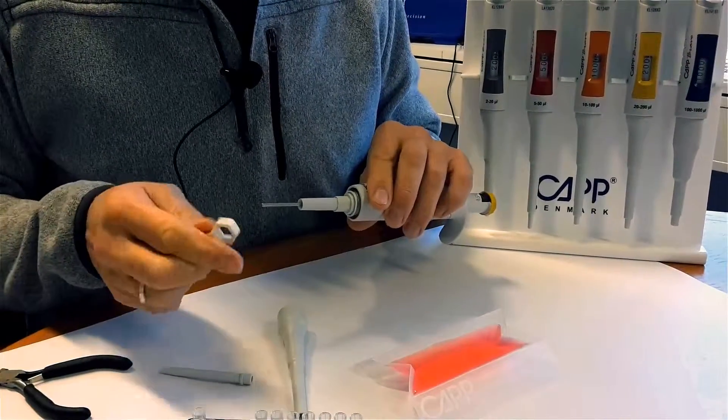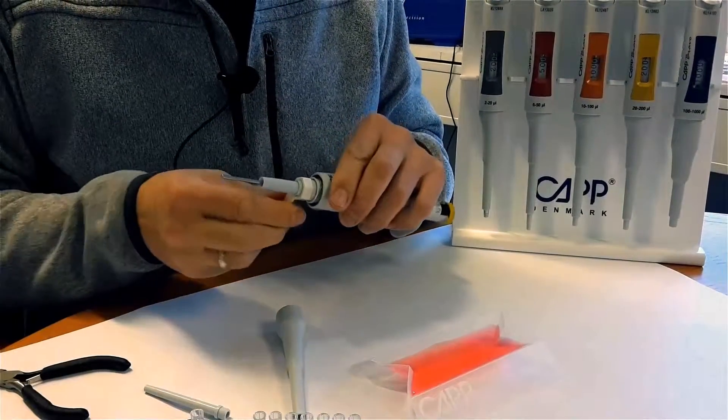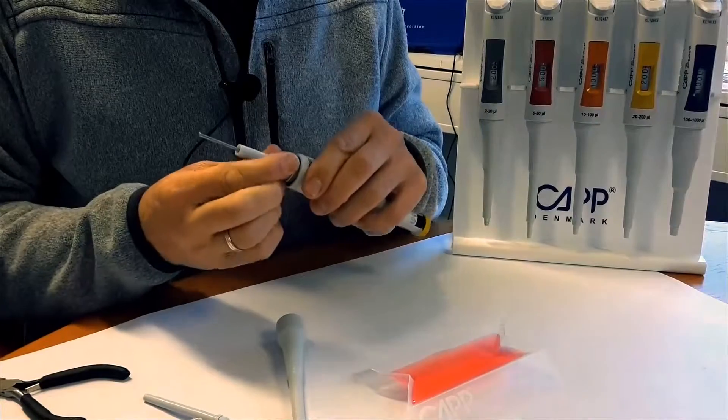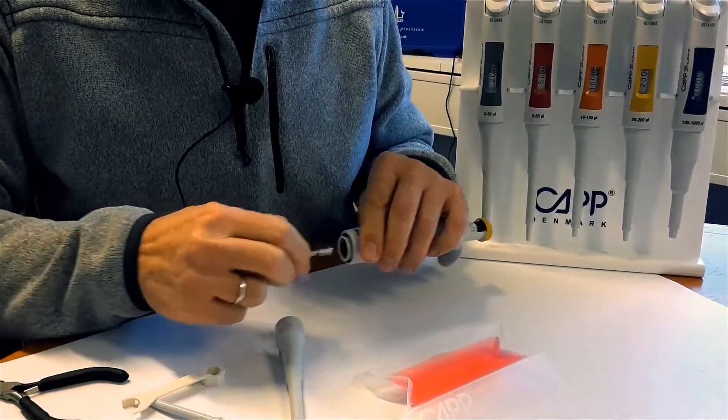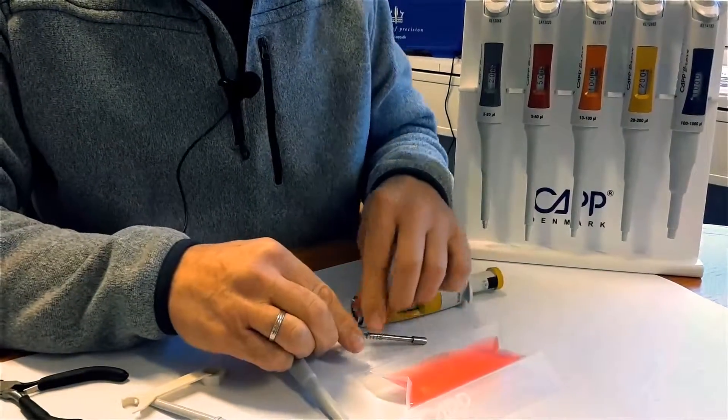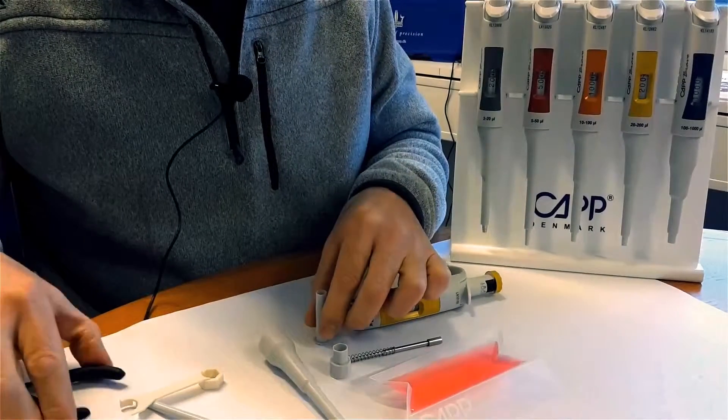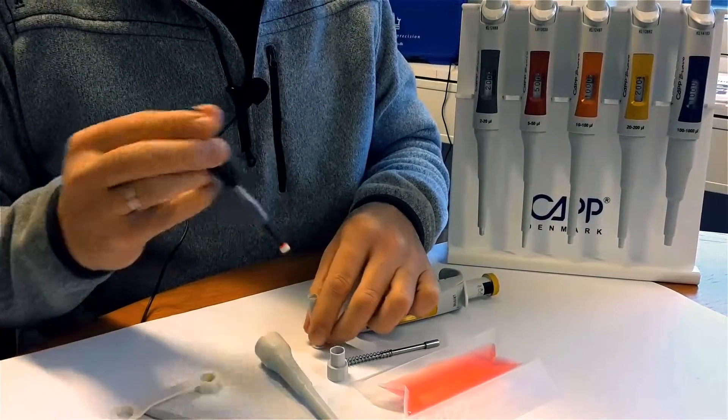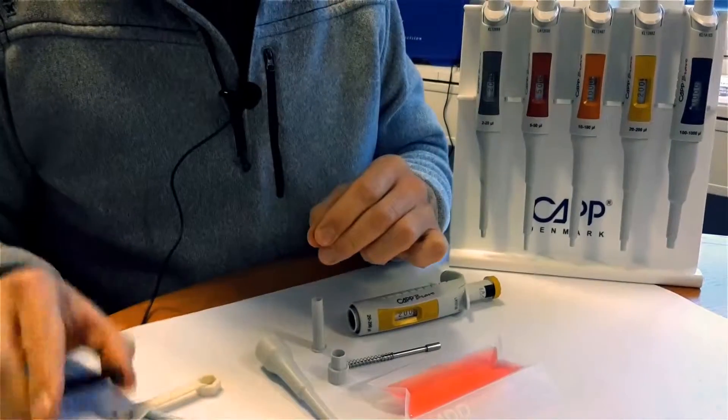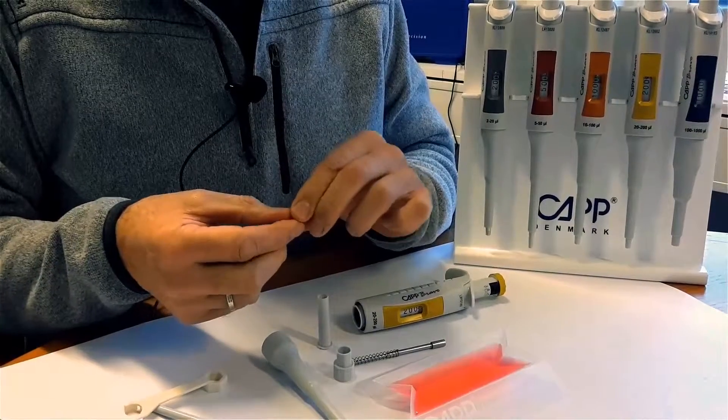Use a spanner to disassemble the tip cone upper part and a pin set to remove the seal and o-ring. Check for visual damages and replace any worn or damaged parts.